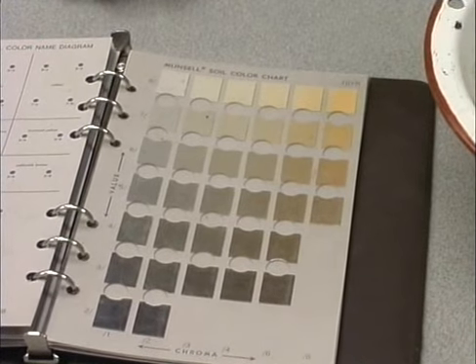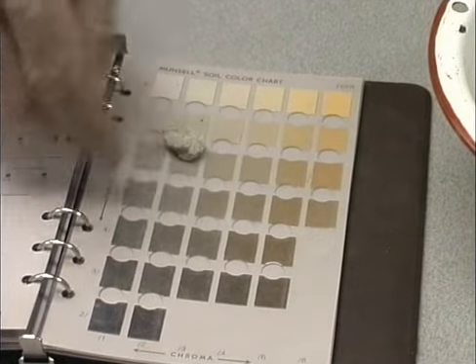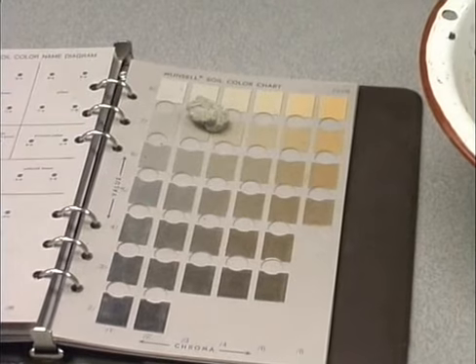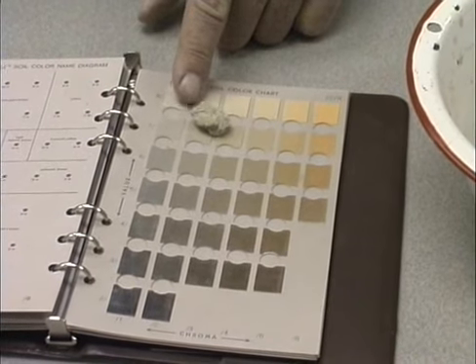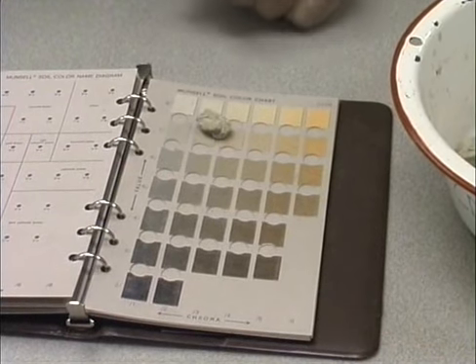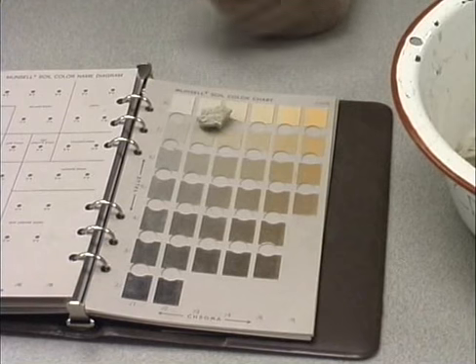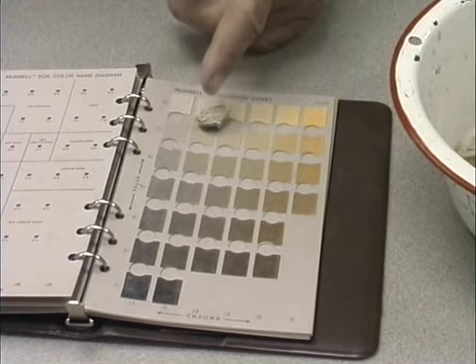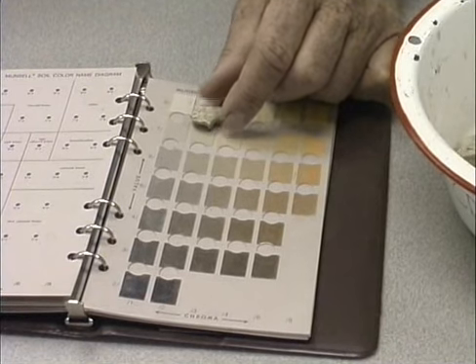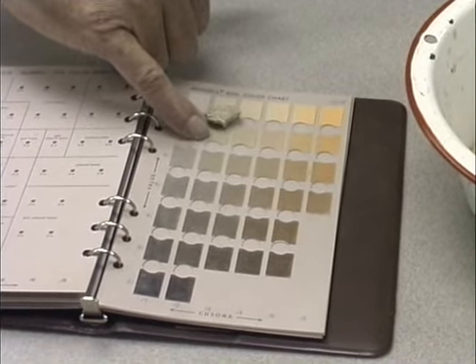So if I look at this particular sample, remove a ped from the pan, I know that I'm not going to be down in this range at all. I'm probably going to be up here closer to the upper left-hand corner of this particular chart. Now there's going to be some variation here because lime does not accumulate evenly within these peds, so you'll have some areas that are lighter than others, but as I look at this, it really matches up the best with the color plate that I've laid it on right here.